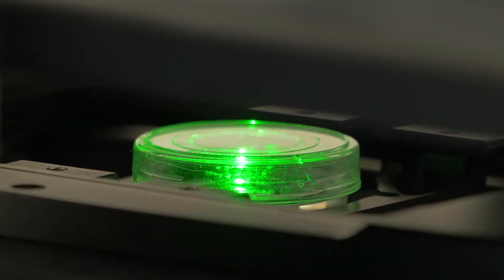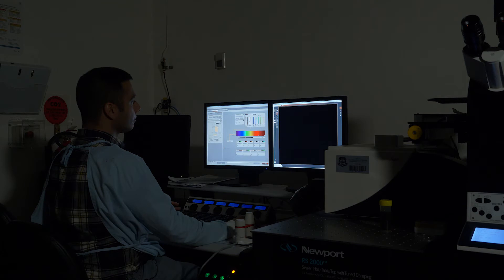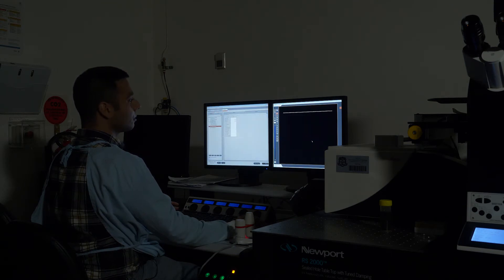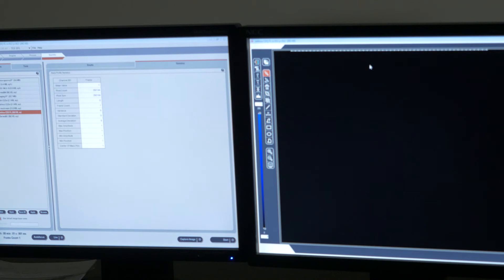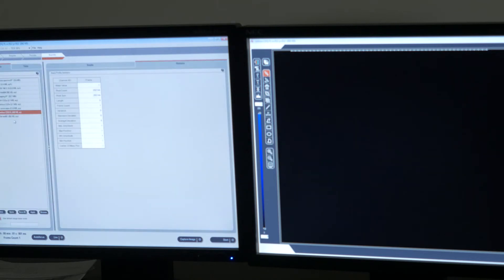Because of this, bright field microscopy is not great when you want to see your cell in detail. So let's turn on the laser of the microscope to do fluorescence imaging and check if we can see more details in the structure. But we can't see anything — all is black and dark. This means that when we have cells only, there is no fluorescence coming from the cells, and the only technique available is bright field, which doesn't give us the detail we need.